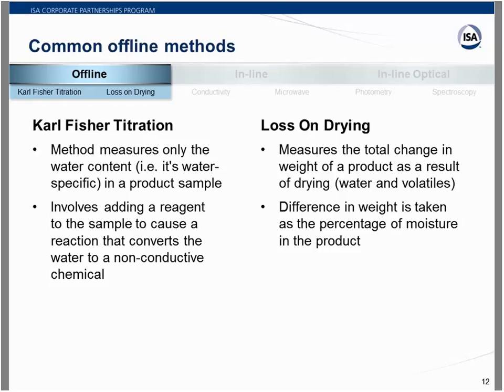Also, water is difficult to release from the reaction vessel surfaces, so you get drift of the final measurement, and you in general have to do a blank with the material you're interested in, and see what the length of time to get to a final endpoint is.